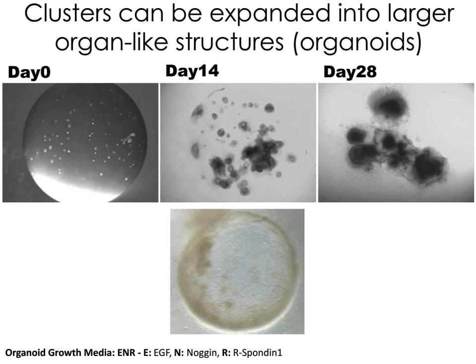And so shown in the bottom is a picture of an organoid that's been grown for about a month in culture. You can see it essentially looks like a soccer ball. So it's a large hollow ball. It's made up of an epithelium with a fluid-filled lumen, and it's surrounded, as you can see, by fuzzy, nondescript looking tissue towards the periphery of this ball.